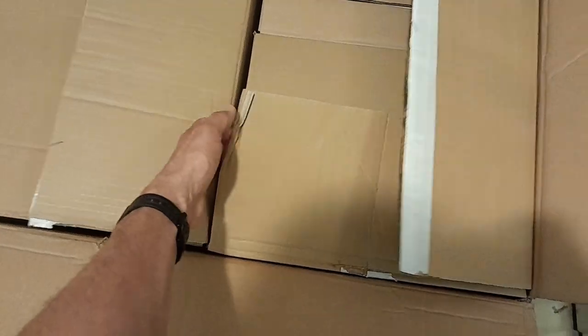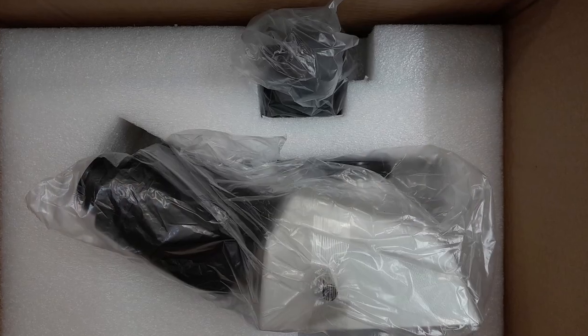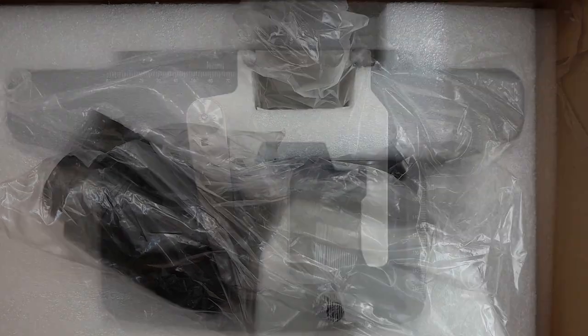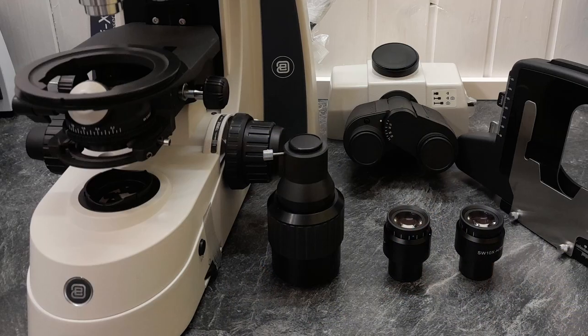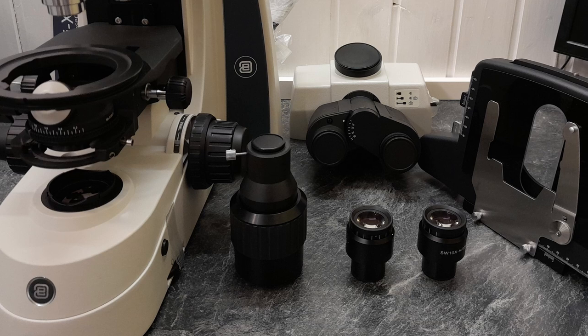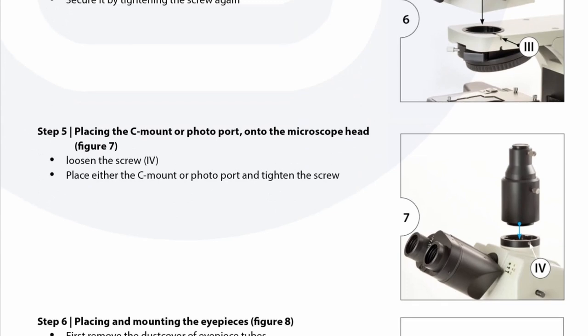The microscope was delivered in one larger box, but this box contained several smaller boxes, because the microscope is quite modular and the different parts were packaged separately for protection. Of course, I arranged everything on my table. There was the body of the microscope. This is, of course, the largest part. The eyepieces. These are wide field eyepieces. And the stage also came packaged separately. So everything is here now and assembly only took a few minutes. But if you need to upgrade the microscope or if you need to put it apart for maintenance purposes, there are detailed instructions available which you can download.